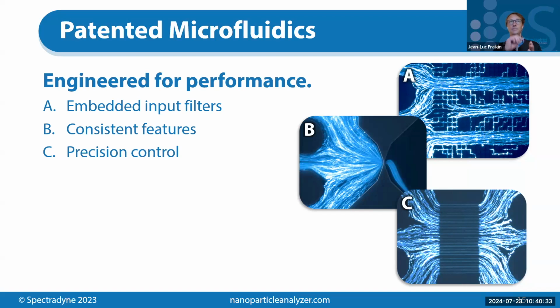We have a range of different cartridge sizes to span the range from 50 nanometers up to 10 microns at the top end for our technology. And so each one has a range over which it measures particle sizes. Your question also mentioned the minimum size that can be entered. So we don't control the size of the small particles. Small particles can flow through as long as they pass through here, no problem. Our detection limit at the small end is determined by electrical noise. And so that's well defined.